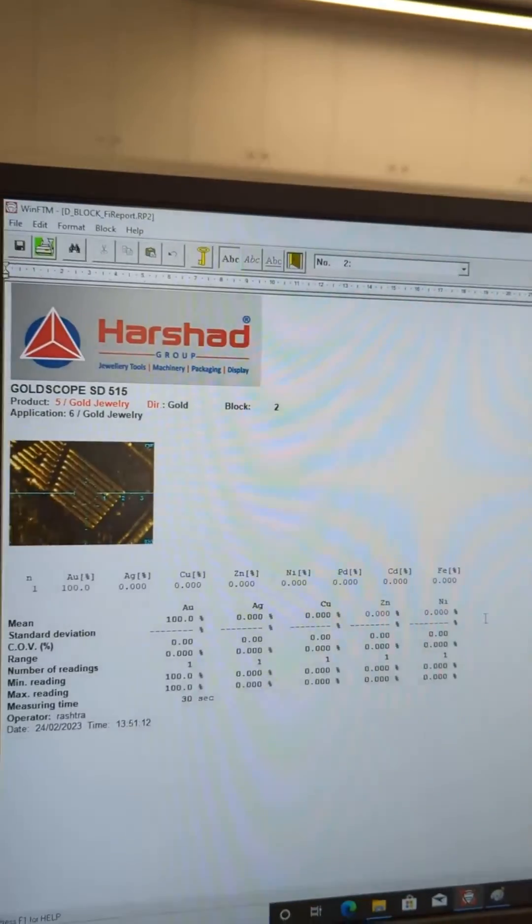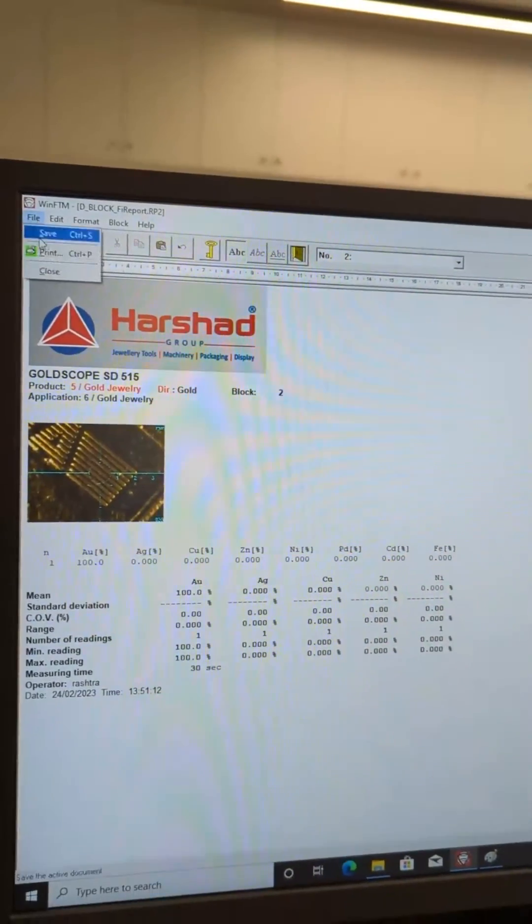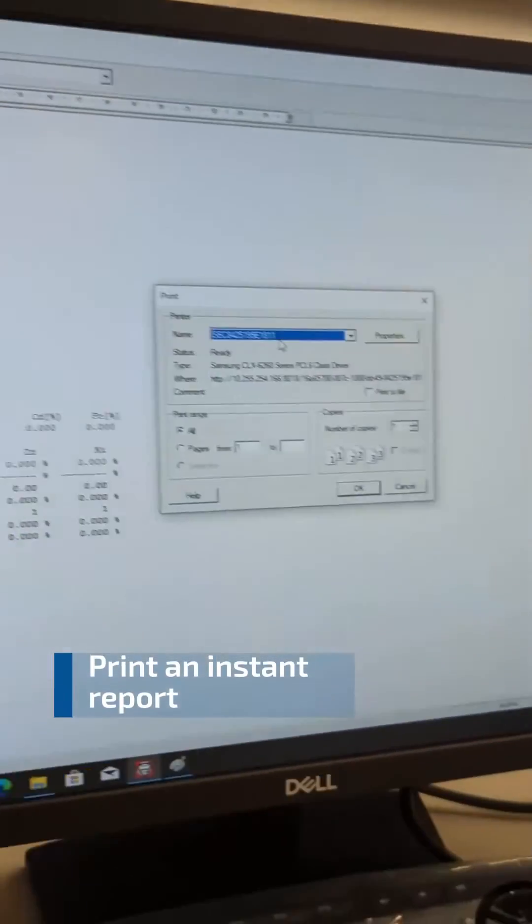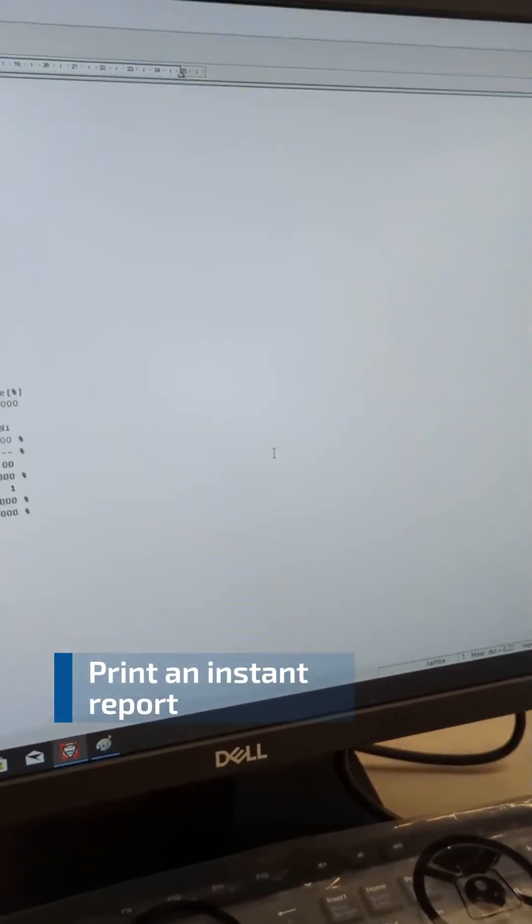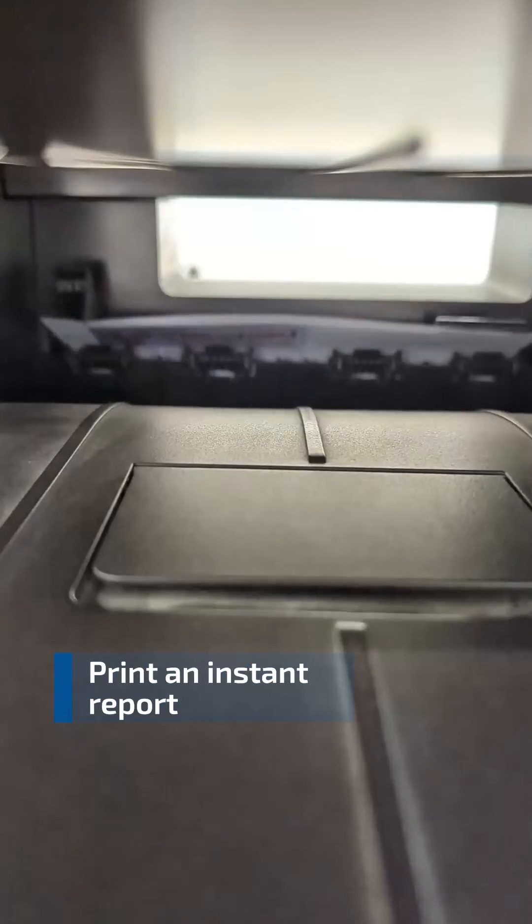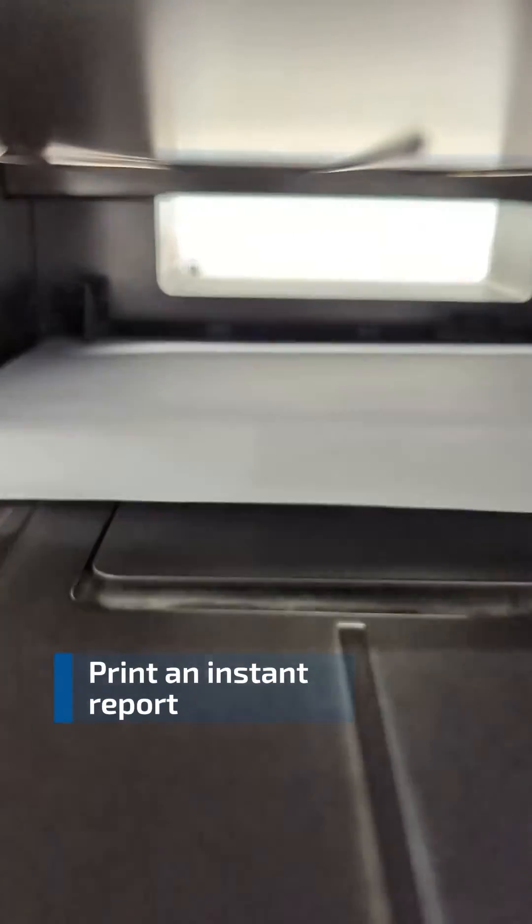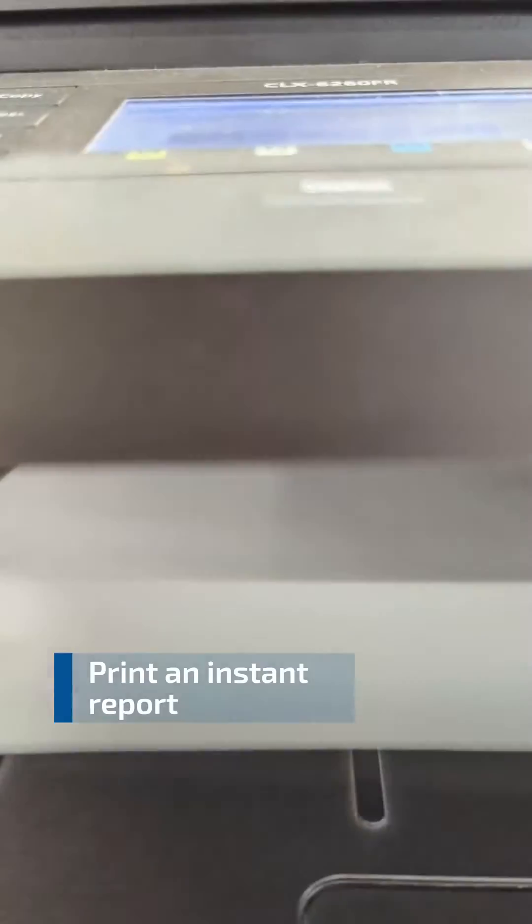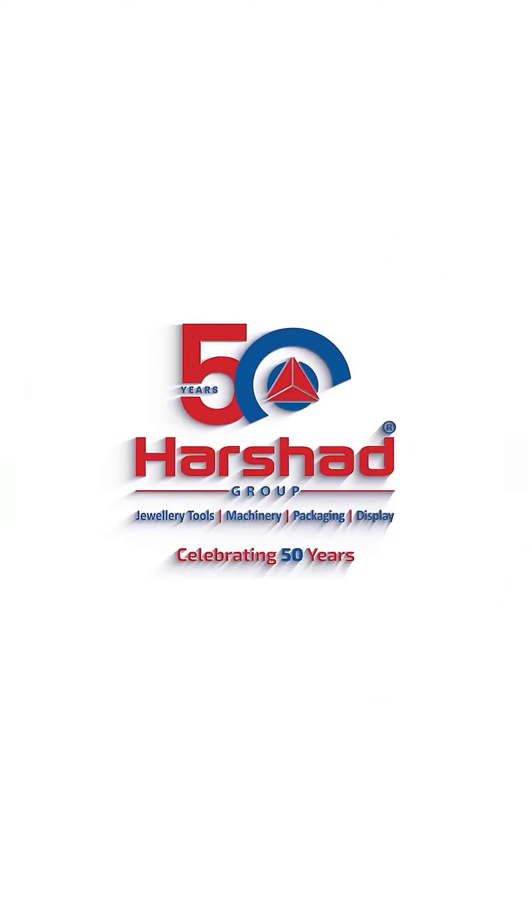Don't settle for less than gold when it comes to testing your precious metals. Trust the Fisher Gold Scope, the XRF Gold Analyzer that delivers fast, accurate, and non-destructive results every time.